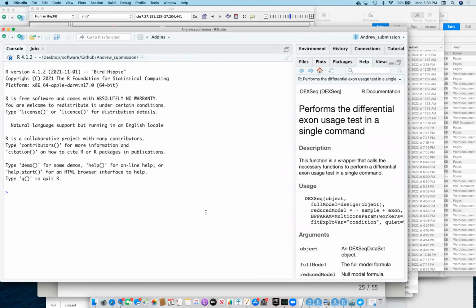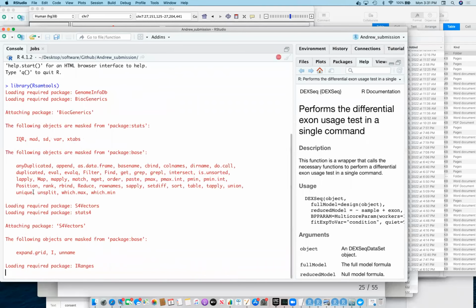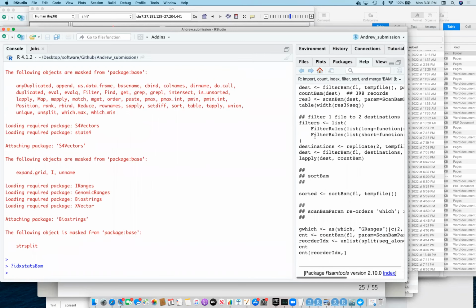I get the feeling that that wasn't a complete BAM file, so maybe I'll try just the demo for now. If you ever get that, where R suddenly breaks like that, you've either hit a memory issue or something you're using doesn't necessarily error well, and it's usually C++. It's passed it down to C++ and some memory is going around. No big consequence, just restart the session again, I guess.